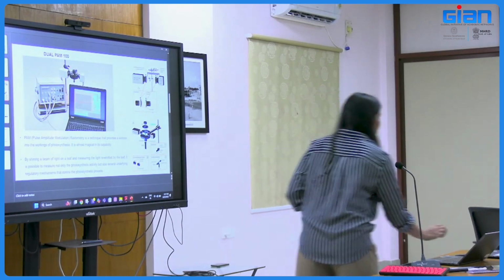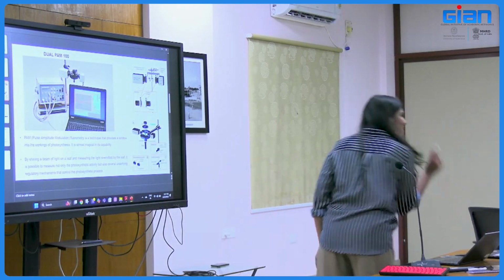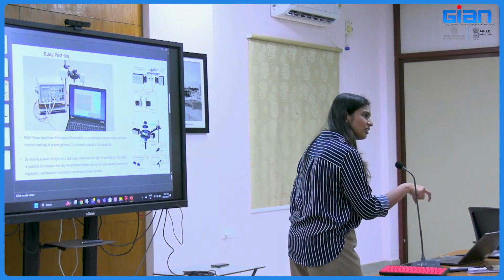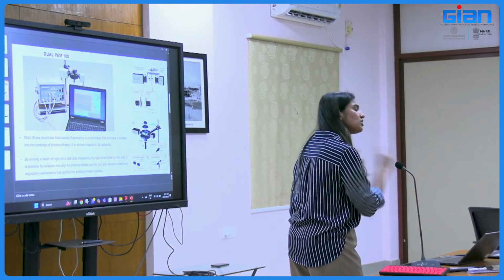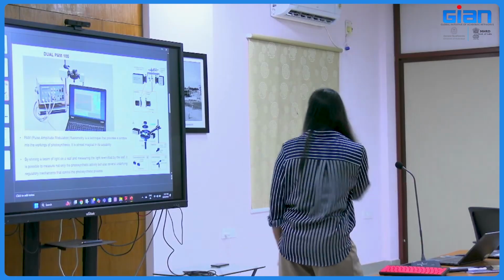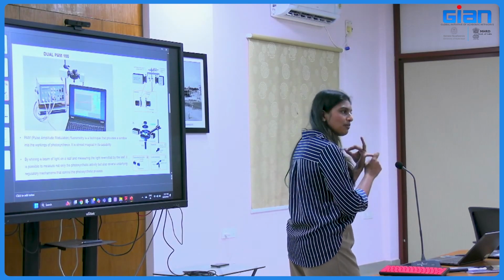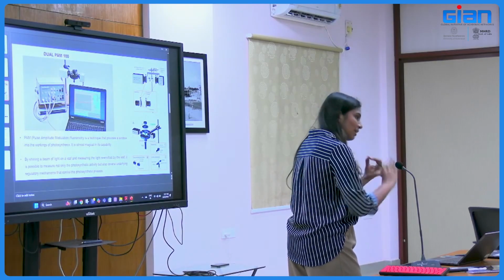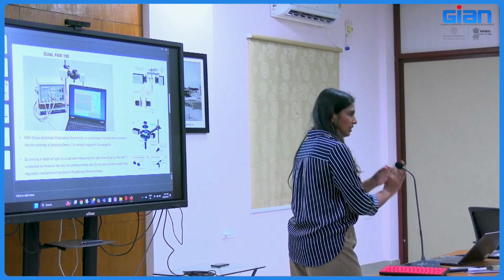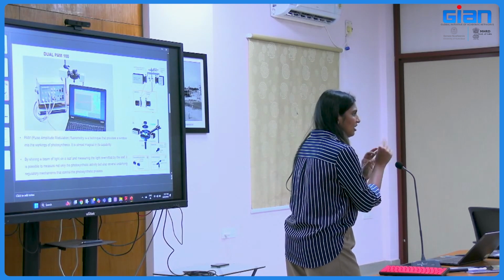Again, this processor is going to process only that change in the frequency of the measuring light, not the actinic light. It never processes actinic light, the background fluorescence from actinic light, or saturating light, nothing. It always listens to the measuring light.